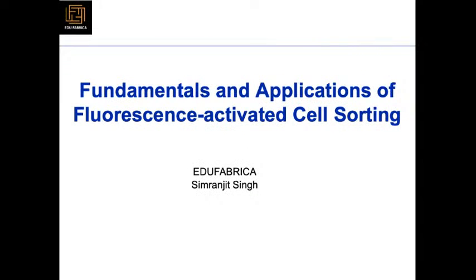Fluorescence activated cell sorting, FACS analysis. So that's the main motive of today's session: how to do fluorescence activated cell sorting.